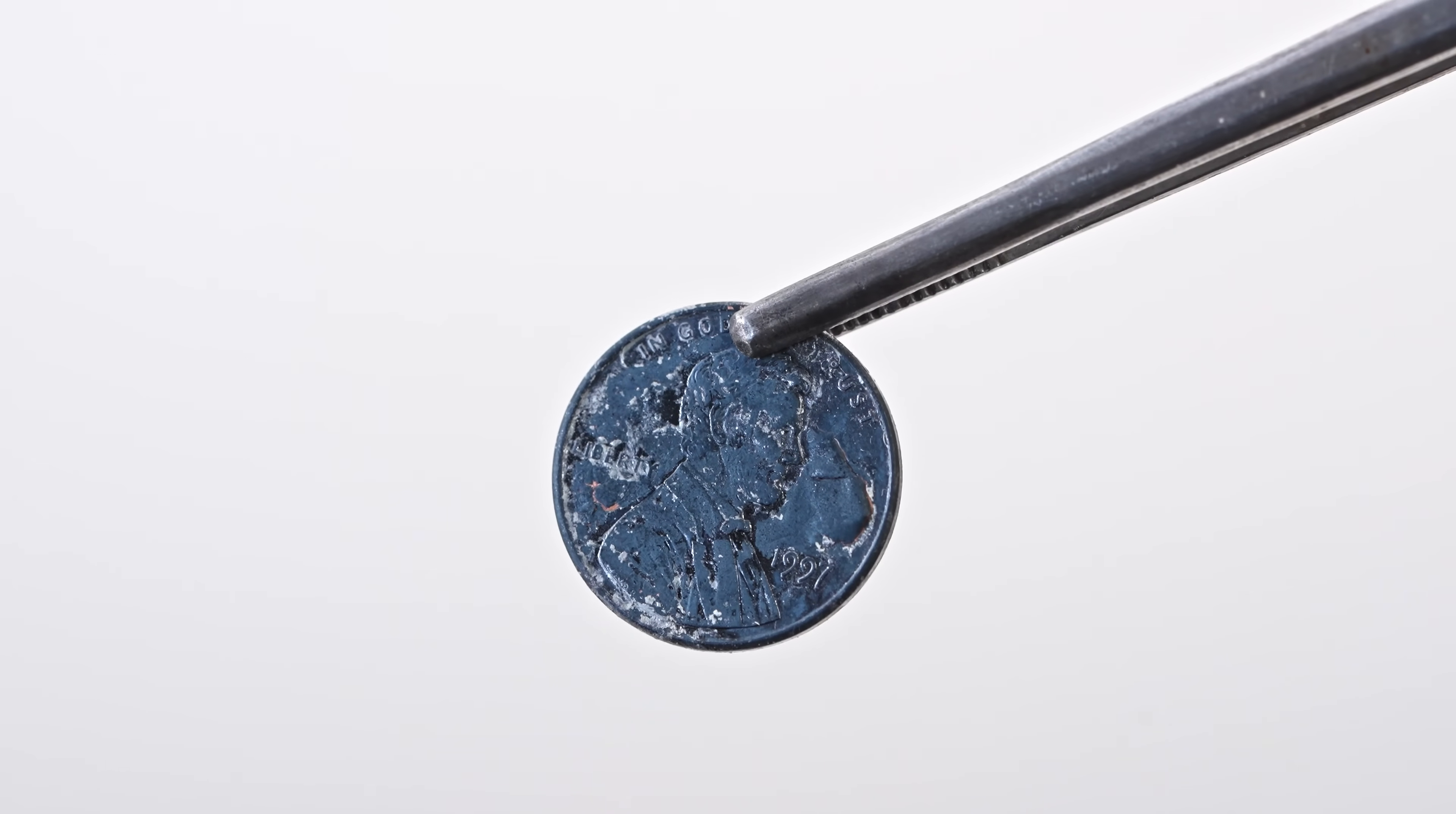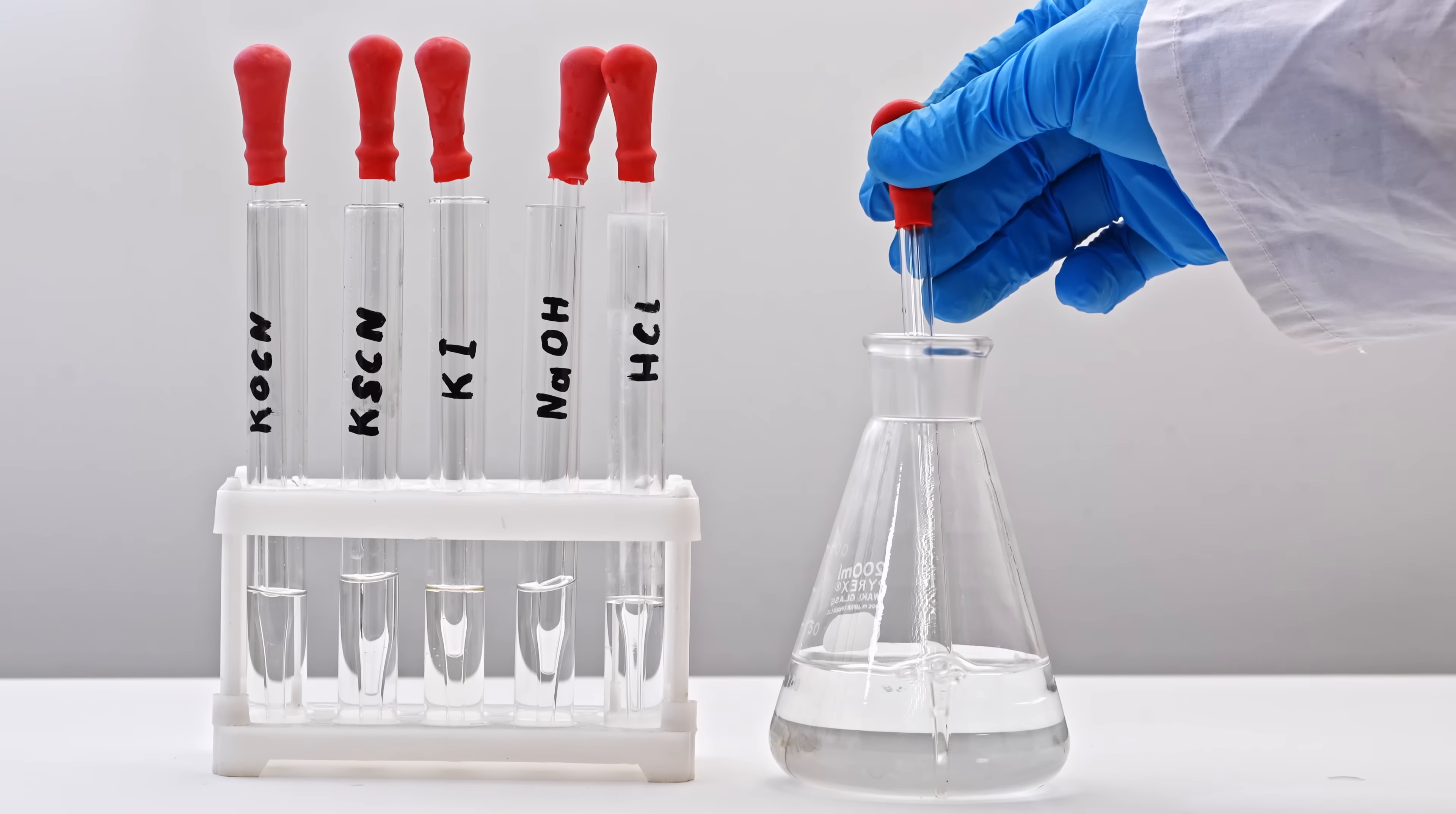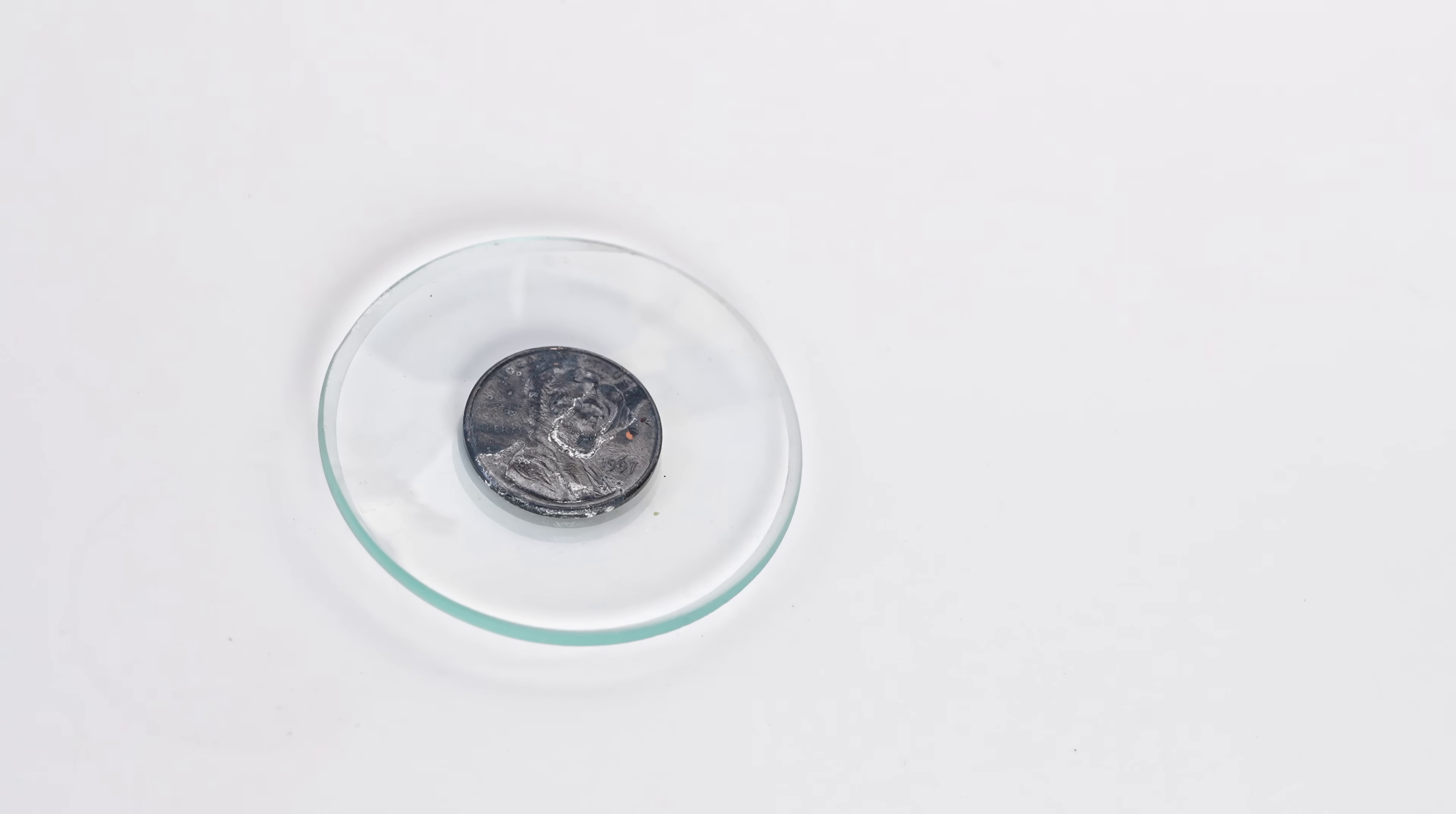Now you have a black penny that cannot be washed off with water. Now, if we add a few drops of a solution containing cyanide ions to this coin, the coin will turn copper color again.